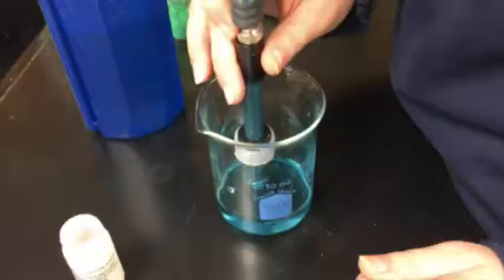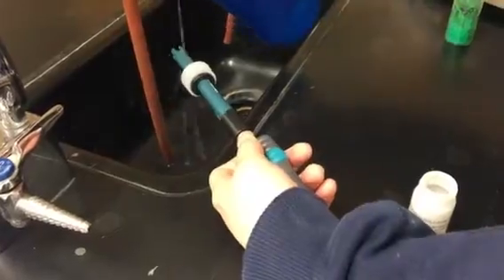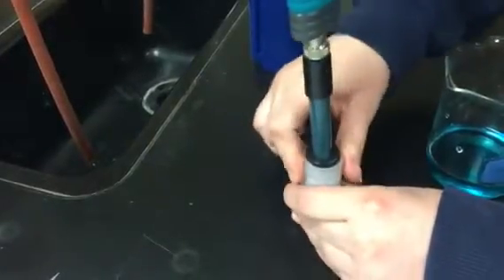After this, we added the chloride to the 50 milliliters of water, took the pH probe out of the solution it was in, and rinsed that off with distilled water. Then, as I submerged the probe into the chloride, Megan pressed collect on the Vernier program, and it recorded the data for us. After we were finished with the pH probe, we left it in the chloride for about 5 seconds. When we were finished with that, we rinsed it off with distilled water, then placed it back into the solution that it came in, for best data.